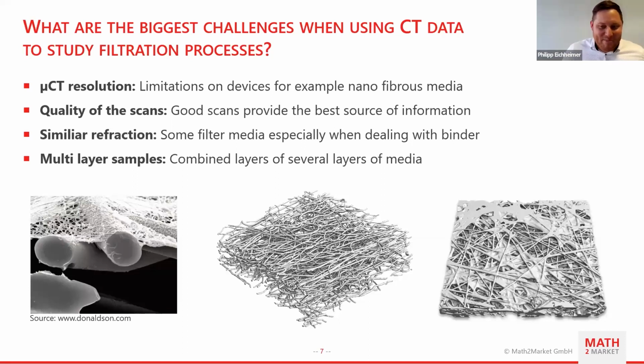Sure, we hope that the CT providers will improve the resolutions in the future. But when we have lower resolutions in the fibers, we need to go to FIB-SEM or SEM representations, which bring additional challenges. As I already mentioned, in SEM we only have a 2-dimensional representation, so we need additional parameters to characterize the depth of the media, like for a 3-dimensional representation.